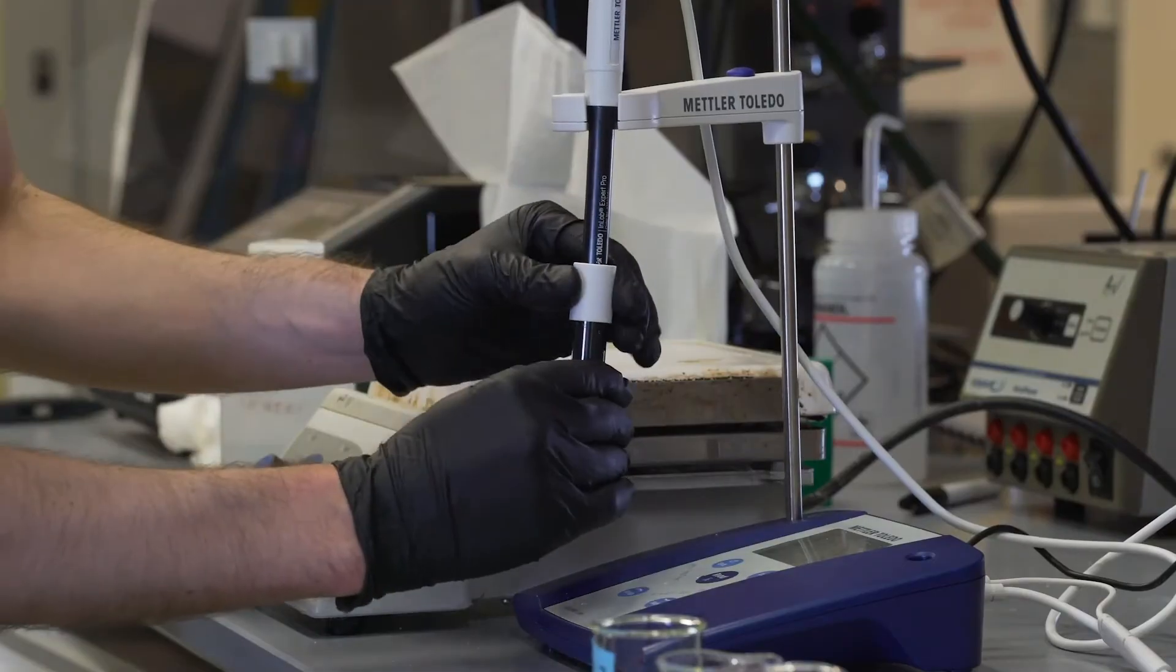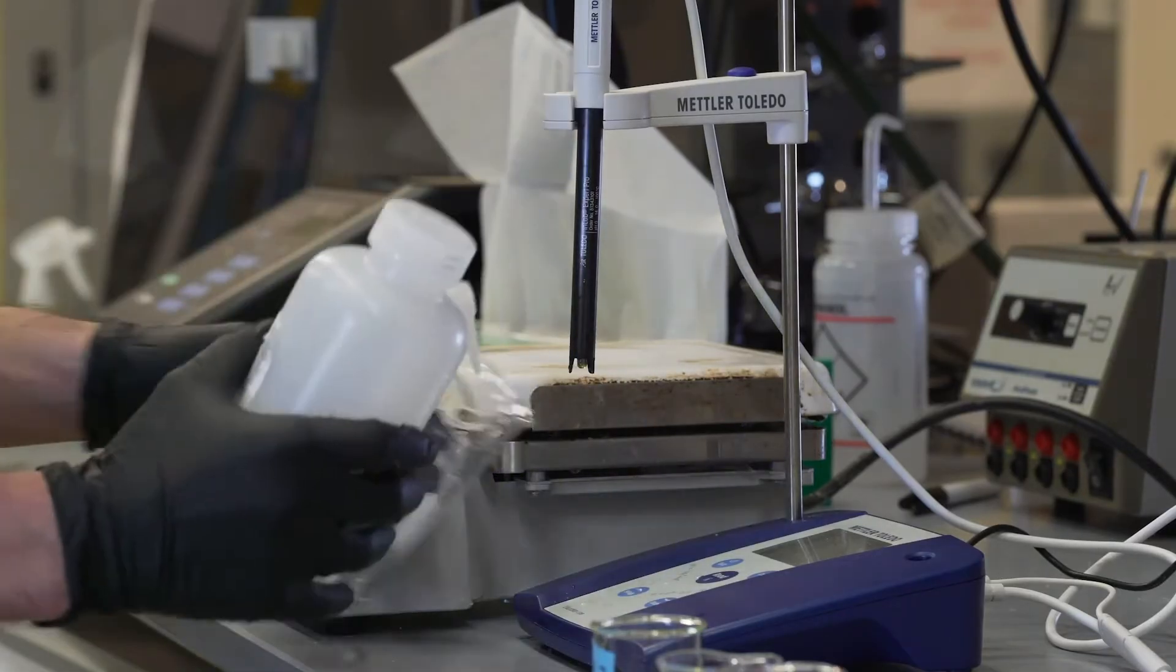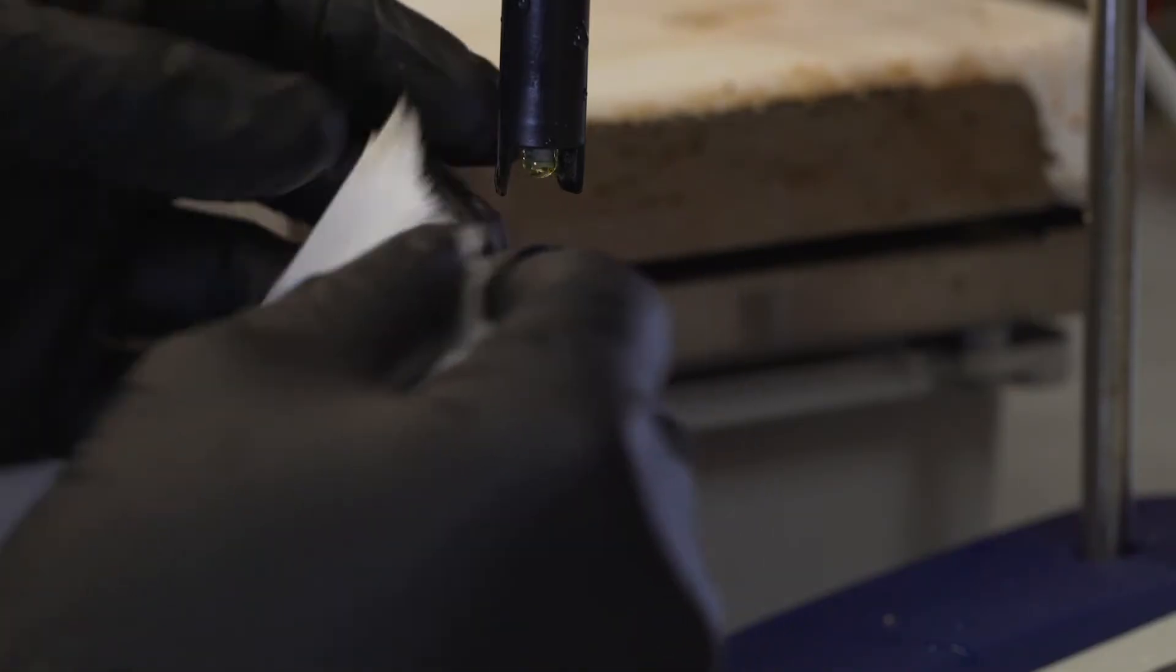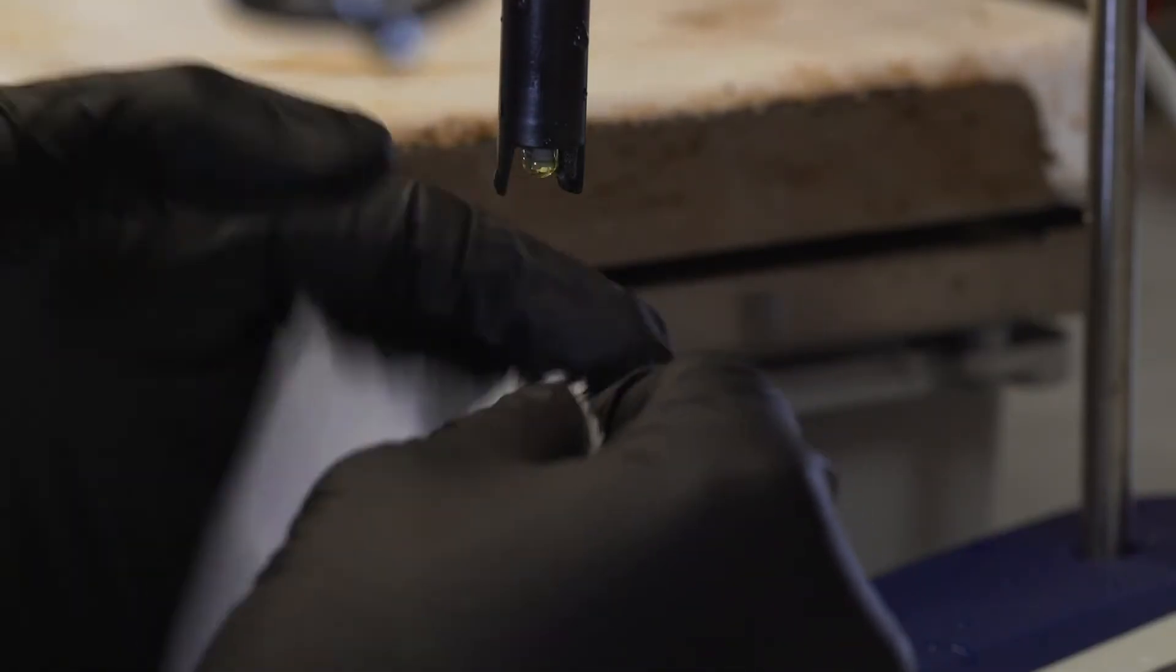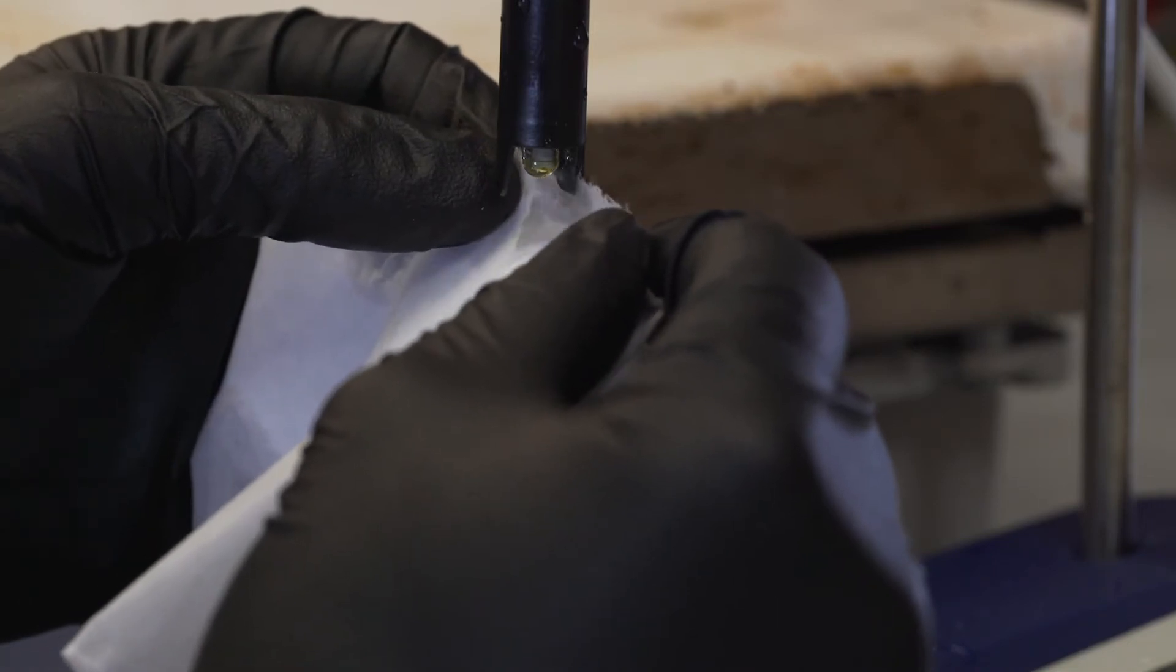Carefully remove the buffer storage tube from the electrode. Place an empty beaker underneath the electrode and rinse it with distilled water. Carefully blot it with a kimwipe, being careful not to touch the glass bulb of the electrode itself. Instead, wick any droplets of water away from it with the wipe.